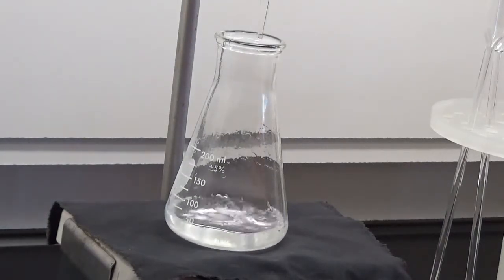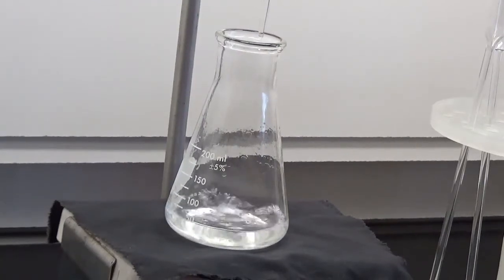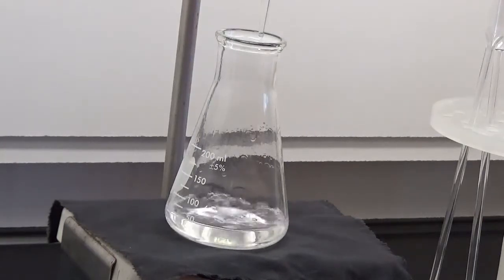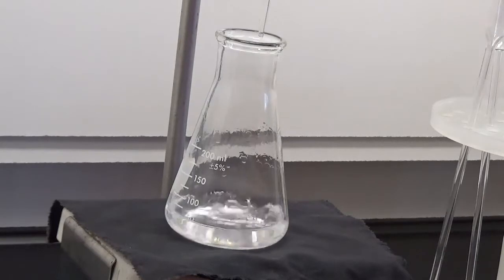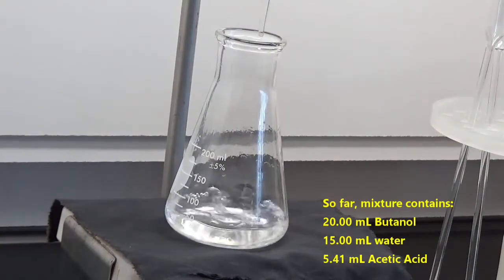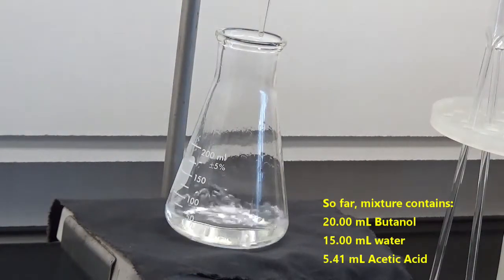I got a pretty good reading that time. Pretty good. Go over the end point or the turbid point. It's 5.41 milliliters. Right.